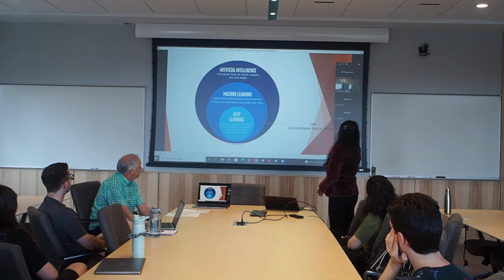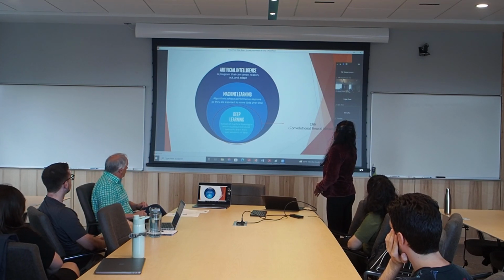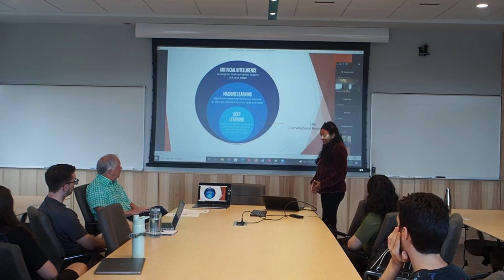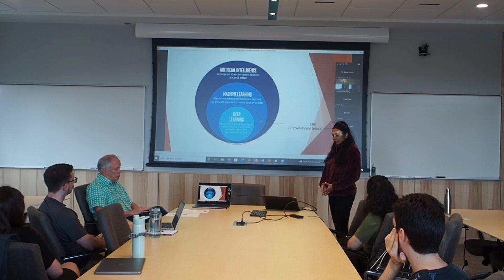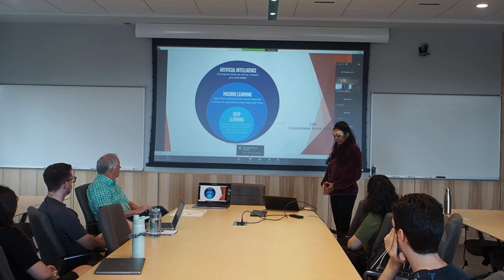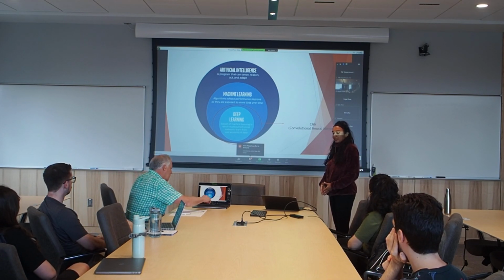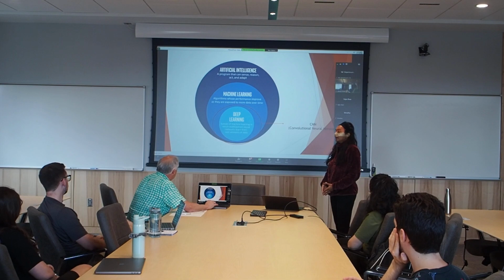So first of all, I would try to apply a big field, artificial intelligence, into our field, which we know is nuclear materials. The purpose is to automate a lot of things that we do. Now, what are the things that we can automate? We can definitely automate something related to the characterization of different microstructural defects that we see in our samples using microscopy. So I have tried to apply this entire field to characterizing helium bubbles that we see in the microscope.